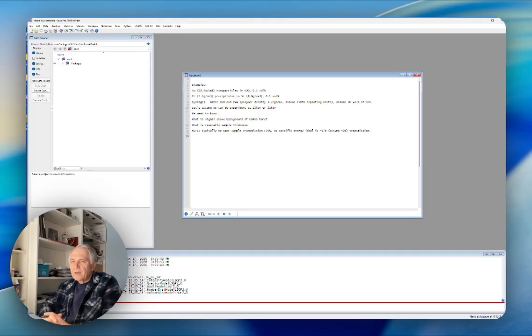Welcome today. This movie is specifically for current and future users of the USAXS instrument, because what I want to show you is how to calculate the expected scattering of your sample before you even come to the beamline, and because I have to do that as a part of it, also how to calculate the sample transmission so your sample has an appropriate thickness for the conditions with which we're going to be performing the experiments.